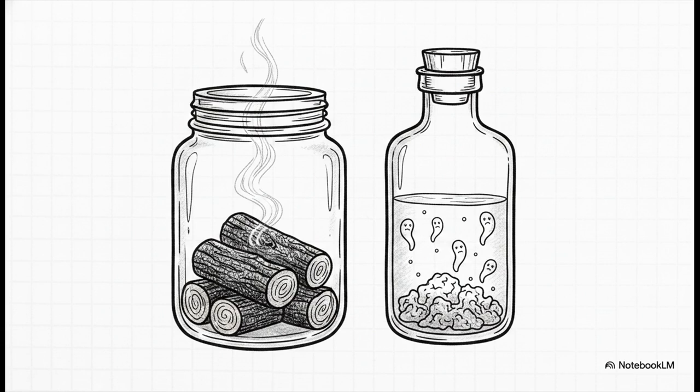Well, let's jump back to our fire analogy for a second. If you put a lid on a jar that has a fire inside and the fire burns up every last bit of air, it suffocates and goes out. But, and this is the absolute key point here, there might still be a bunch of unburned wood left sitting in that jar. It's the exact same thing in our test.